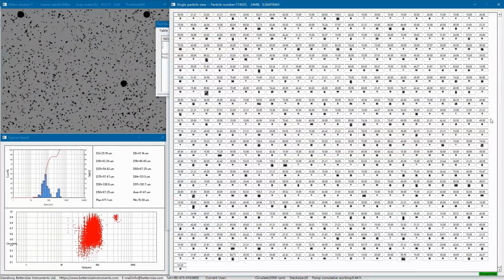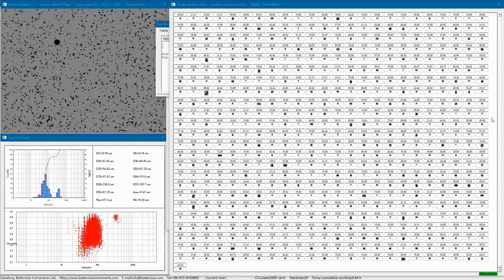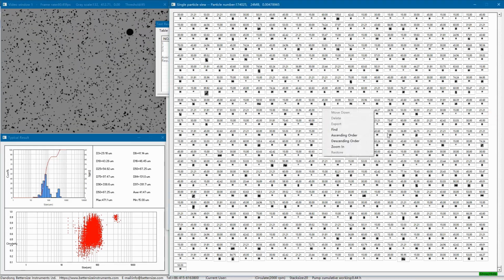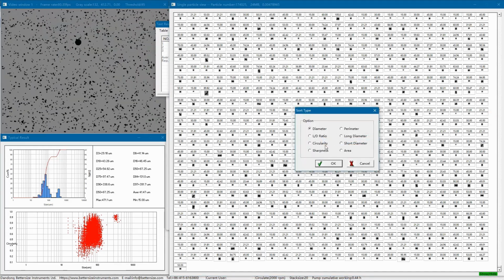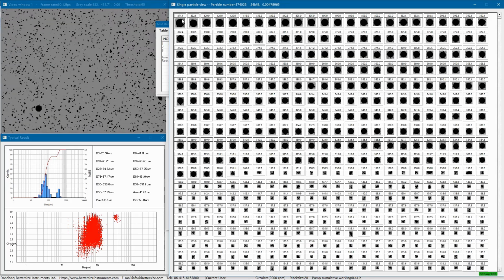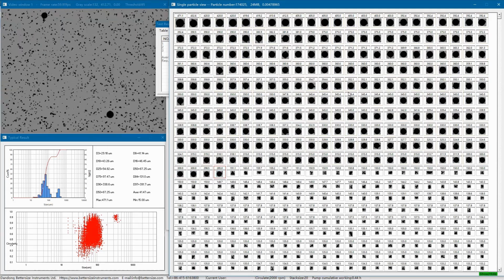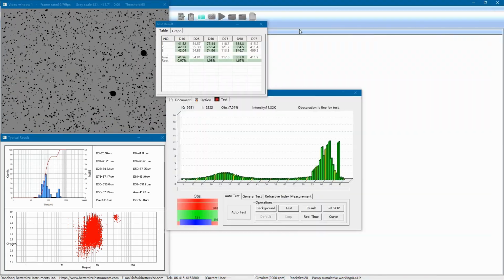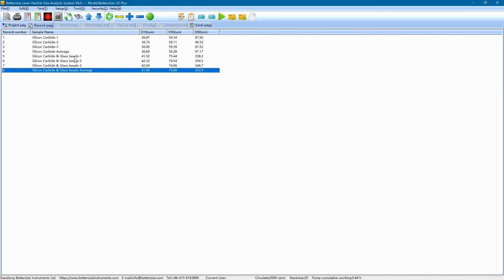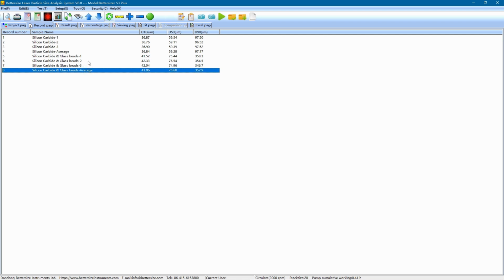Therefore, by combining laser diffraction with dynamic image analysis, it turns out that the Bettersizer S3 Plus takes advantage of both methods, and can measure very small and very large particles precisely in only one system. Now the measurements are finished, so we close all the testing windows. These results are automatically saved in the build project and arranged in order.